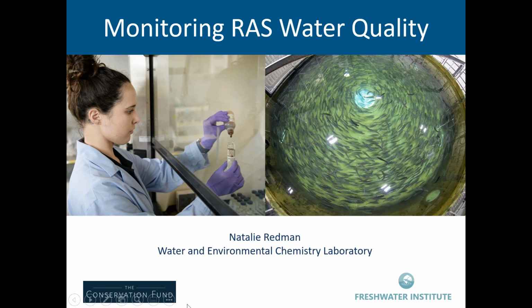I will be presenting on monitoring RAS water quality. In this presentation, I'll be going over what parameters are important to analyze, how to sample, and a few methods that we currently use at the Freshwater Institute.